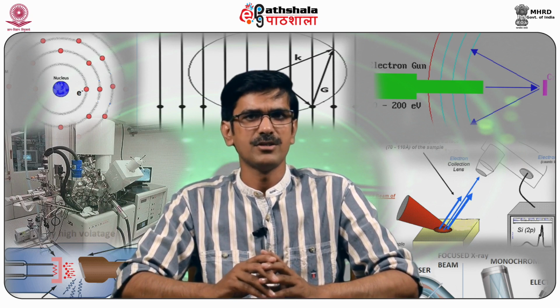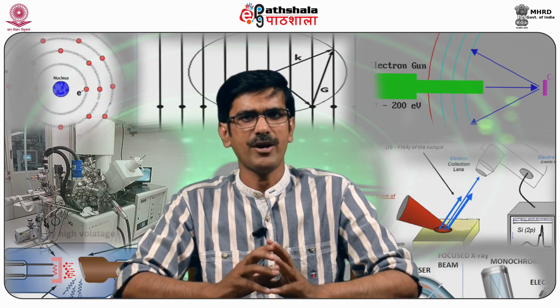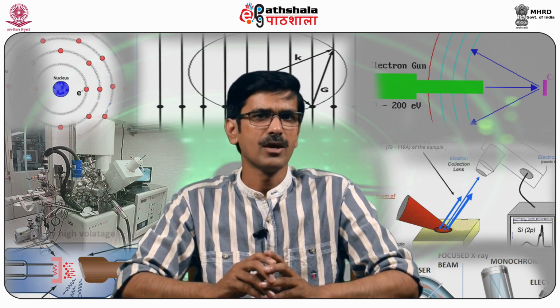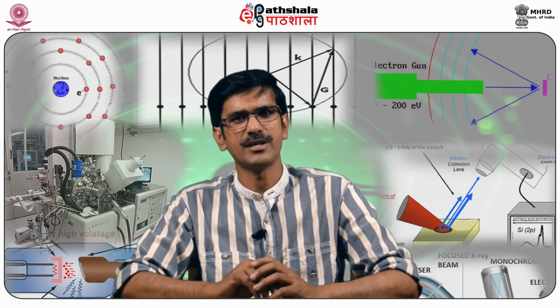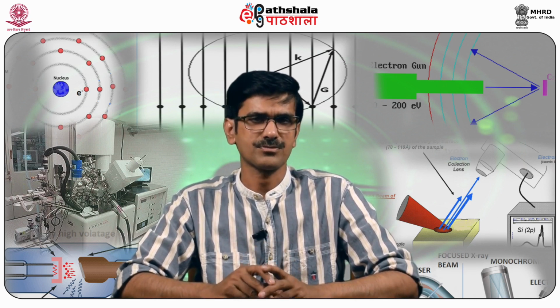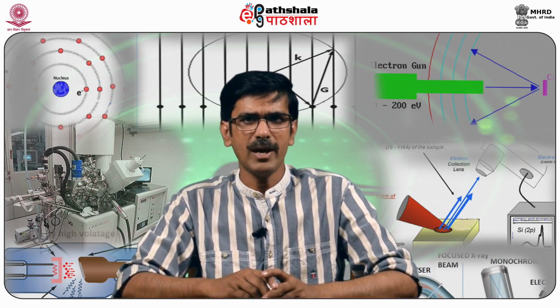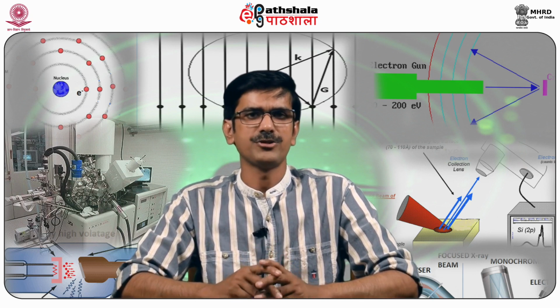The silicon drift detector measures the energy of an incoming photon by the amount of ionization it produces in the detector material. In the SDD, the material used is high purity silicon with a very low leakage current. The high purity allows for the use of Peltier cooling instead of traditional liquid nitrogen.